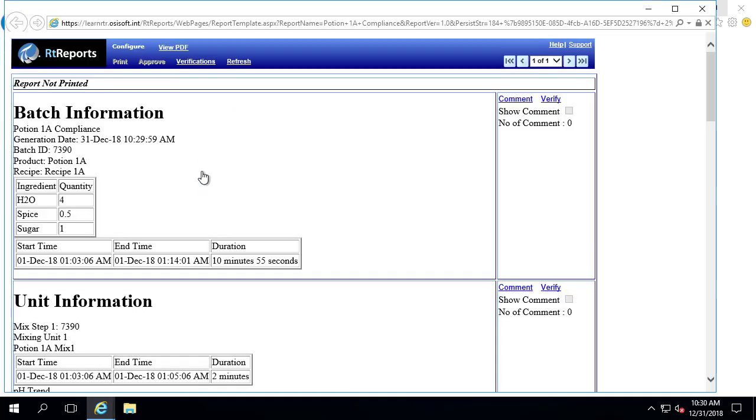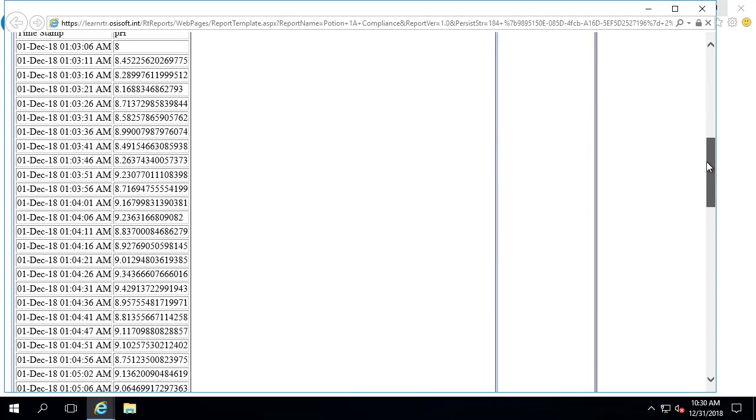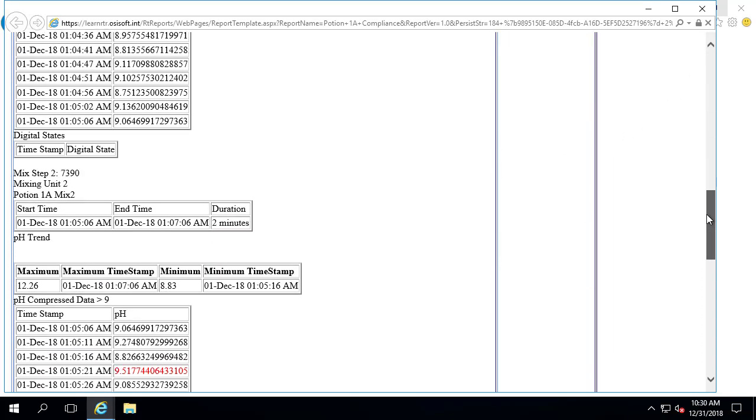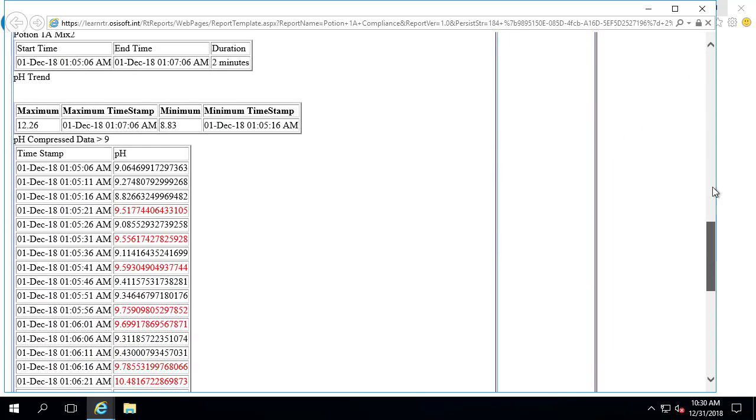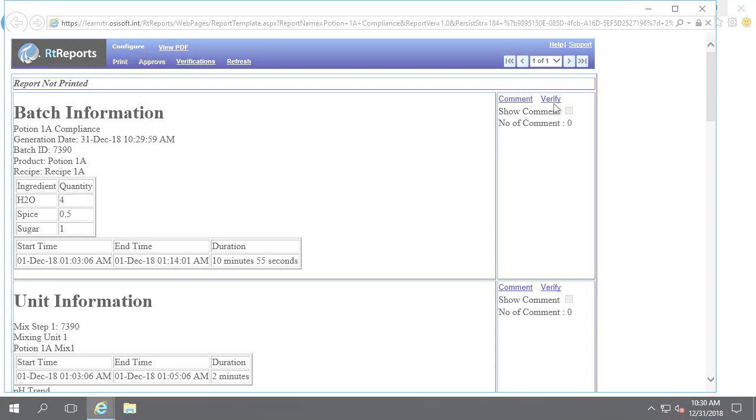Reports can be set up to require fully traceable comments, verifications, and approval cycles before an official watermarked report is generated to PDF.